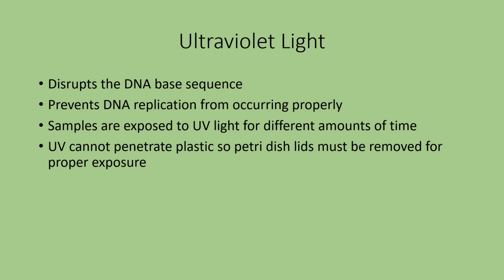Some labs have UV lights typically located up along where the wall meets the ceiling, and when the last person leaves for the day, they will turn off the regular lights and flip on the UV lights and have those on all night. It will help clean the surfaces. It doesn't penetrate, say, on the tabletops, but it helps to sterilize the air that is present there. So it depends on the circumstances as to whether you can use UV light or not. Obviously, if there are people around, you don't want to cause damage to yourself and the DNA on you, so you have to be careful when and how you use it.